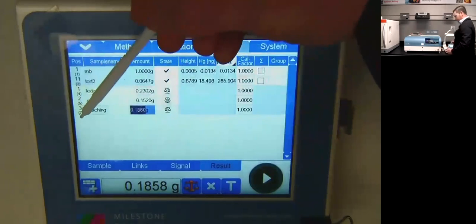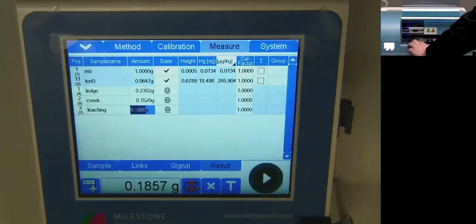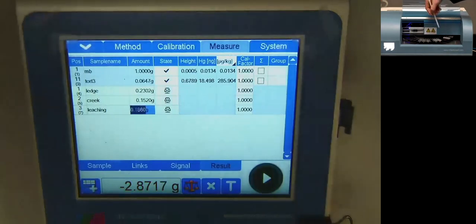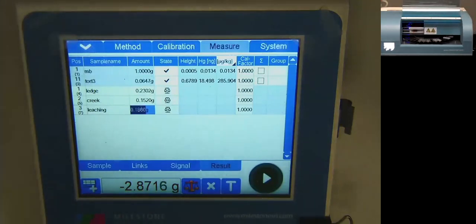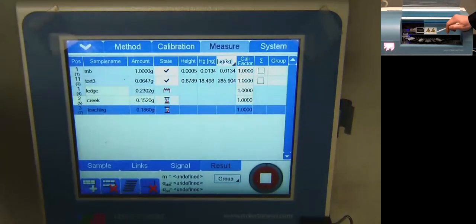I've selected carousel position three on my 40-position auto sampler for this sample. Here's my first soil and second soil on the auto sampler. Now I take my small quartz boat with my soil, place it on position three, and I'm ready to run. I press play — the auto sampler moves over, lifts the sample with an elevator, and pushes it into my combustion furnace. The light goes from white (standby) to red (running). When the batch finishes, it'll turn green.